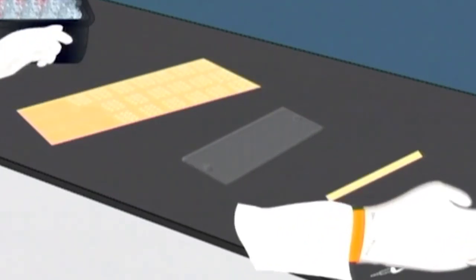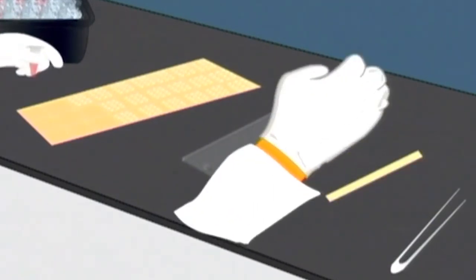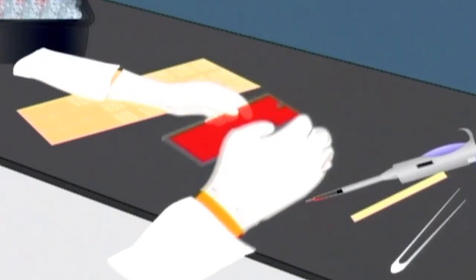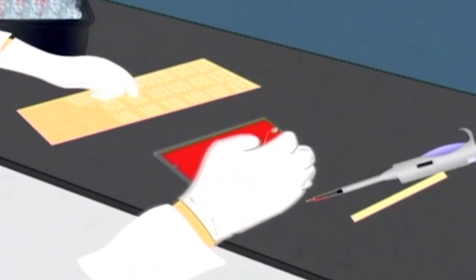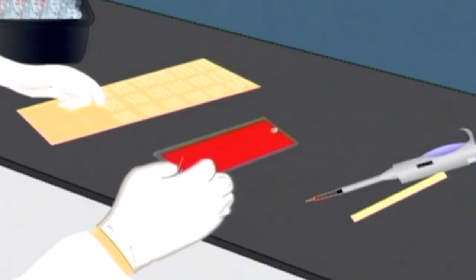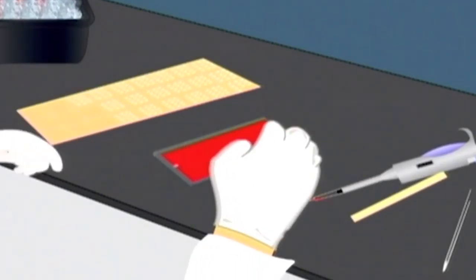First, you need to prepare the in vitro transcription translation mix, which contains TNT buffer, T7 polymerase, amino acids, RNase inhibitor and DEPC water. Apply that on the slide, which contains the HybriWell gasket, and then seal the ports. Now, this printed slide, which contains plasmid DNA, has the in vitro transcription translation mix, shown in the red color here. The next step will be to incubate these slides for the protein expression step.